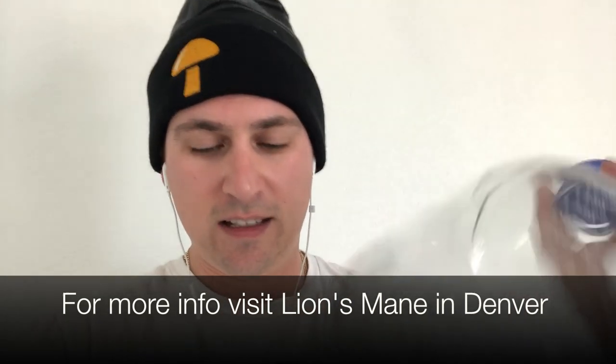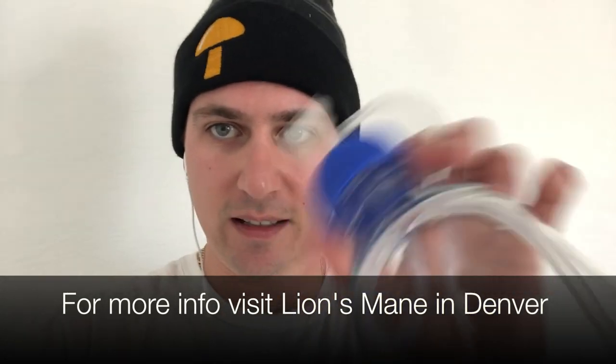And for those of you who've been following me, you know that I love Bjorn's honey. This is what I use in all my liquid cultures, just honey and Colorado Rocky Mountain water. This is local honey from Boulder, Colorado. Shout out to Bjorn's. It's the best honey in the world, and there's just something really cool about using honey and mycelium and bees and mushrooms. I think that it really all goes together, and it might be the key to future agriculture. So I'll go ahead and mix up that liquid culture and get these sterilized, and then I'll go through how to operate this media extractor.